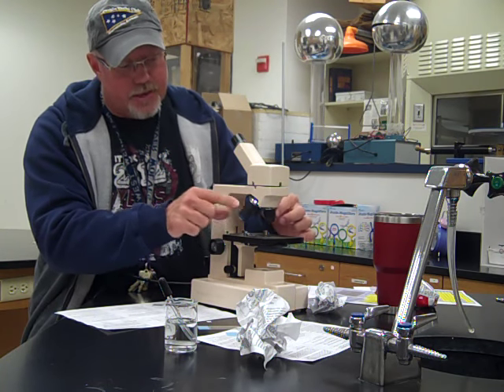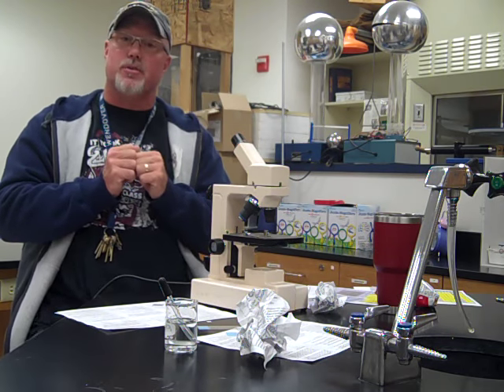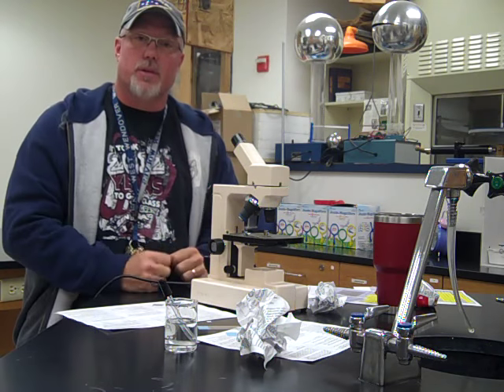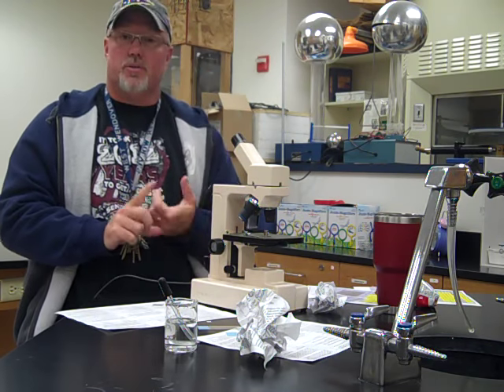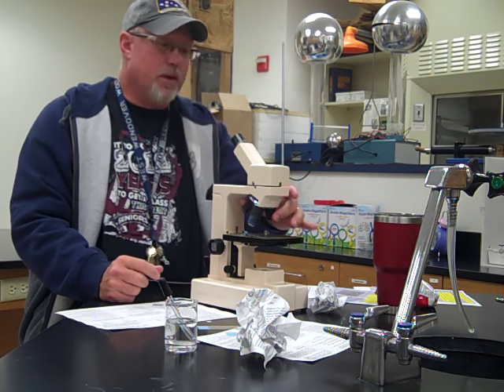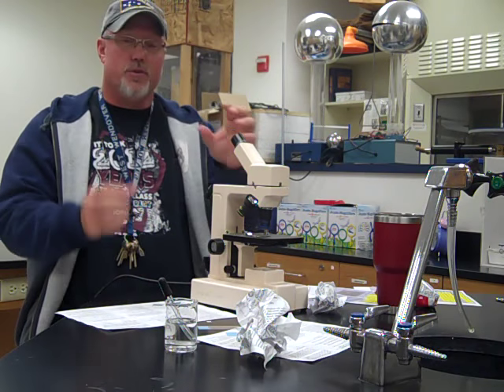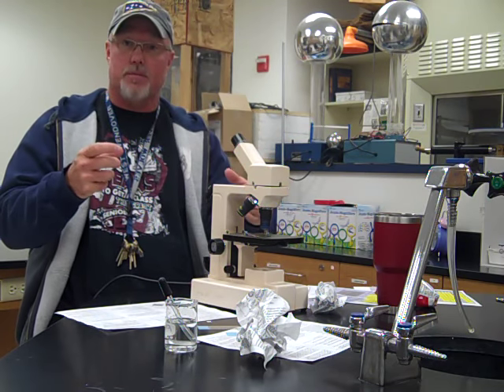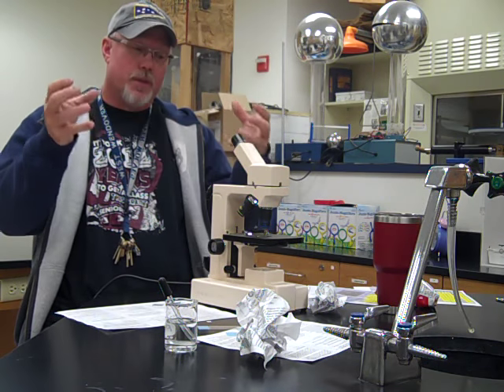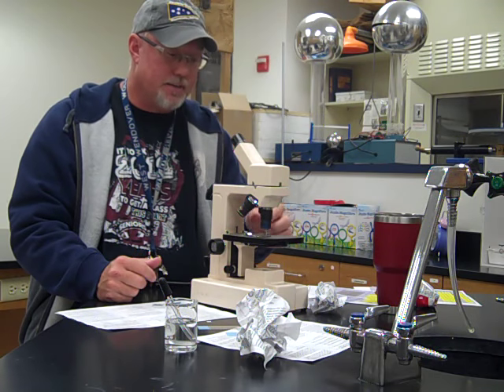Your last objective is the blue one, which has the blue lines on it. This is the highest power that you're going to see, so your field of view gets really small, but your objects are really large. This one is the hardest one to focus and to find something if you move things in there. Back at the ocular, there is a pointer. If you find an object on low power or medium power, you want to put that object at the end of the pointer. That way when you switch objectives, it makes it easier to find it.